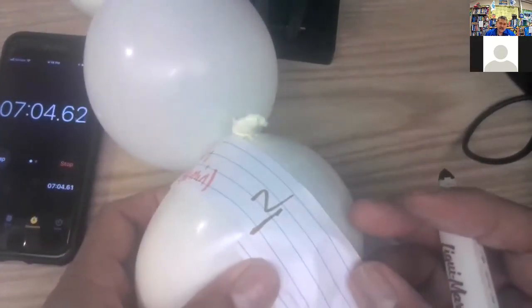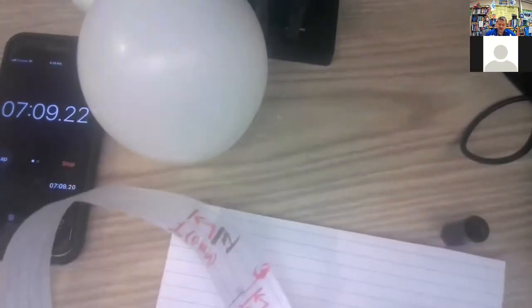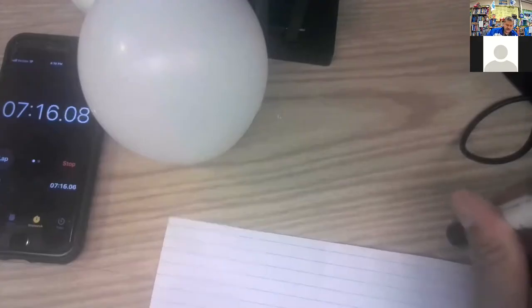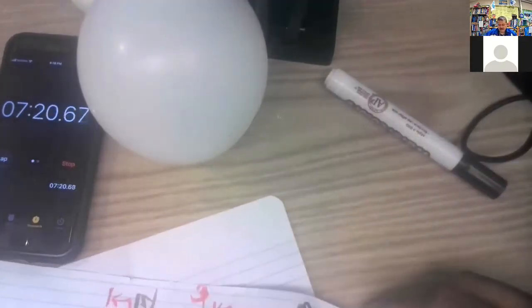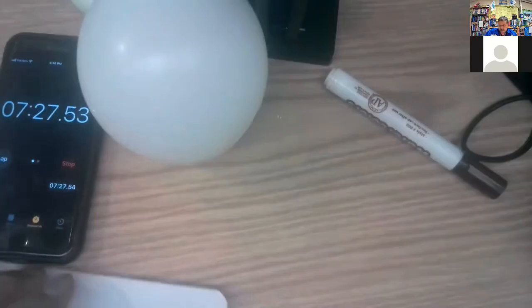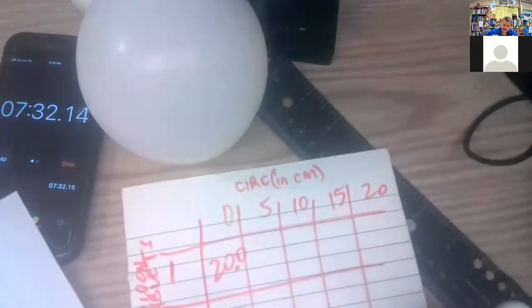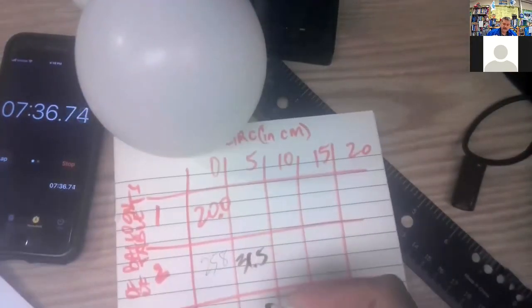Look at that. So it's 2 and 3 this time. So I am not confident that 3 is going to give us great results. But let's take a look. Well, that solid line was 25. So 25 plus 6.5 is 31.5. So on my table, 5 minutes is 31.5.